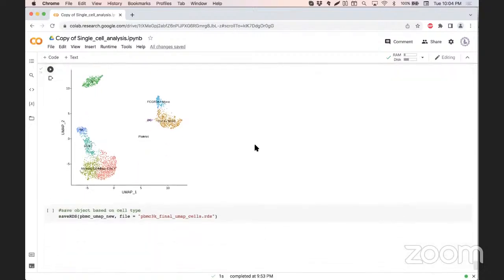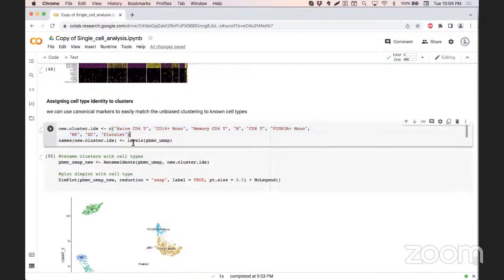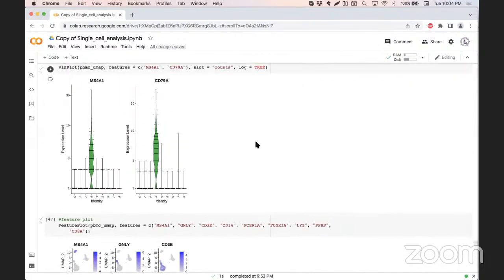And yeah, this we can do. So this one we have to do externally. And I think there are also other databases available to do this, or if you give the marker genes, those will actually identify different cell types also.